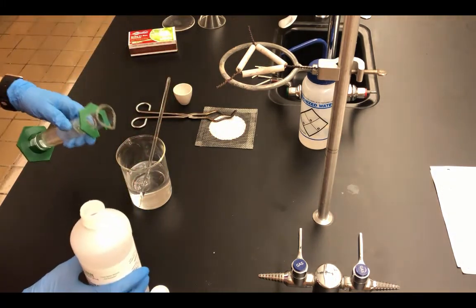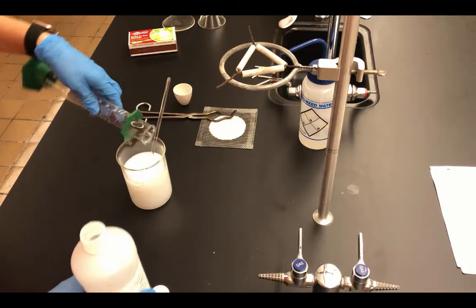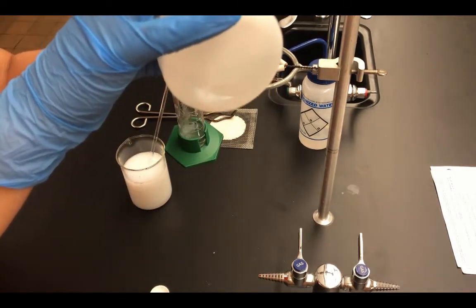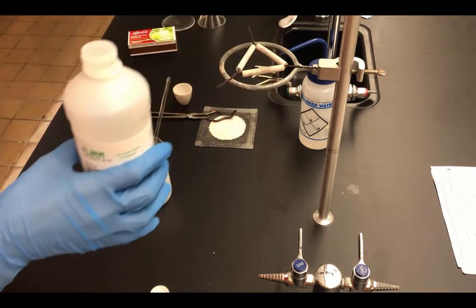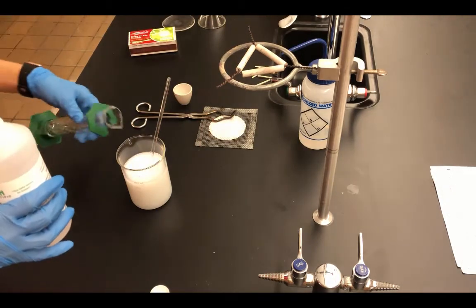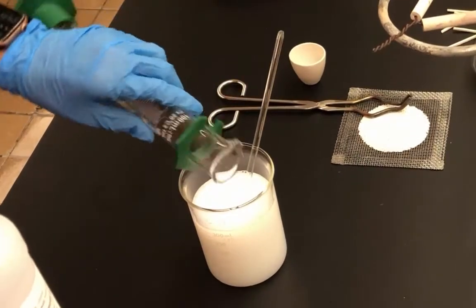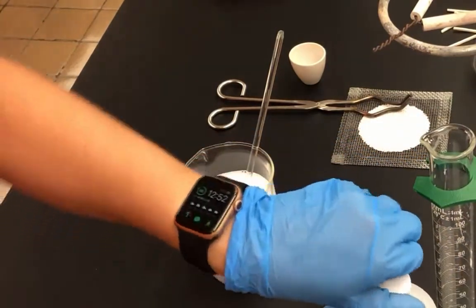So there's 100 milliliters. And let's add another 25. If you go over at all, make sure you record that, but I got it to exactly 25. So we've added 125 milliliters of the 0.2 molar calcium chloride.